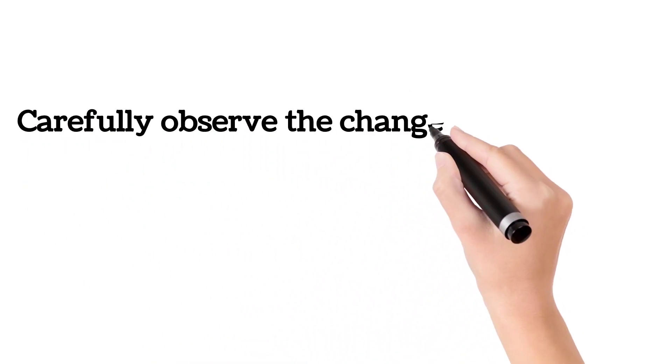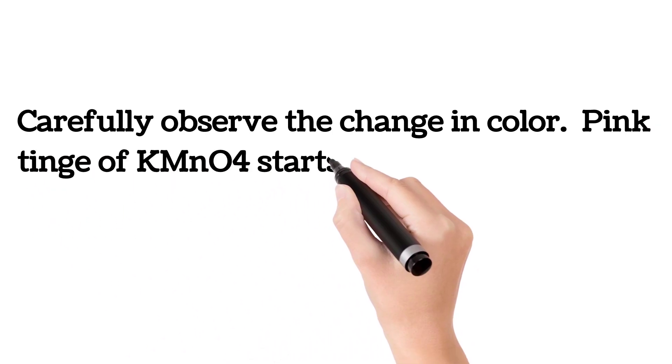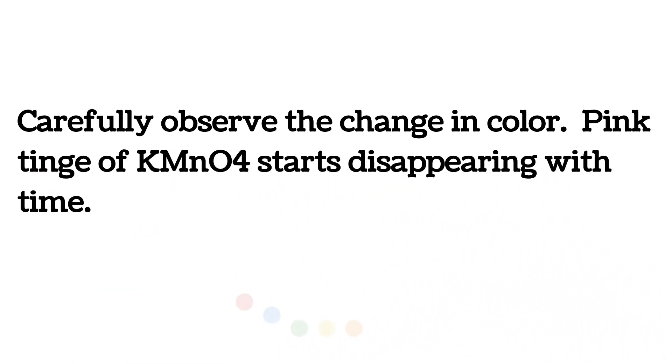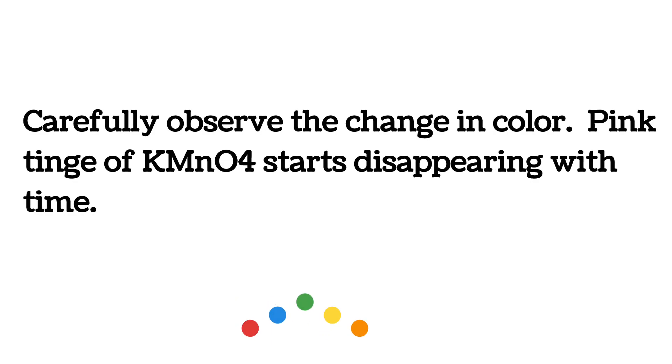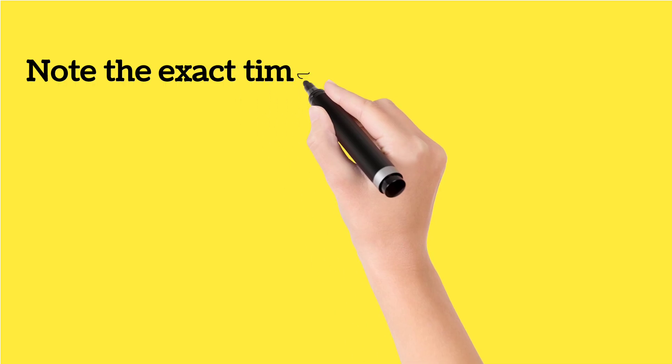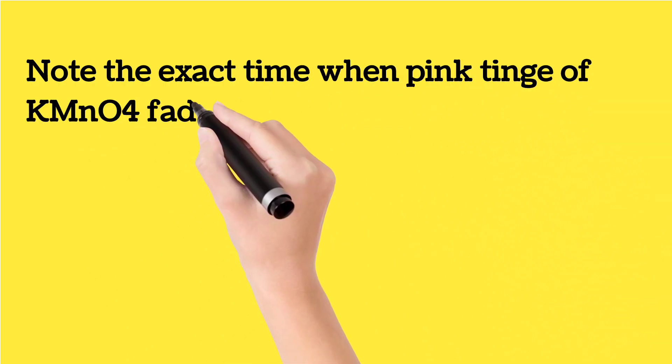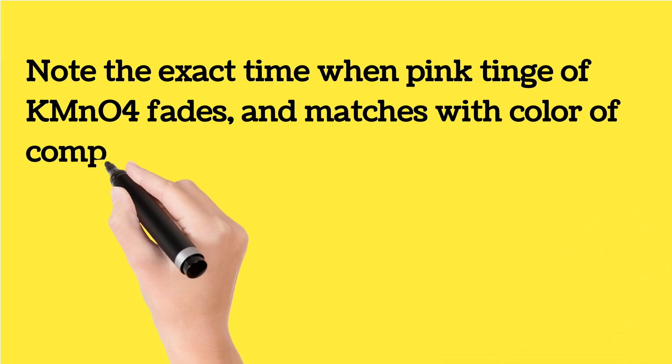Carefully observe the change in color. Pink tinge of KMnO4 starts disappearing with time. Note the exact time when pink tinge of KMnO4 fades and matches with color of comparison solution.